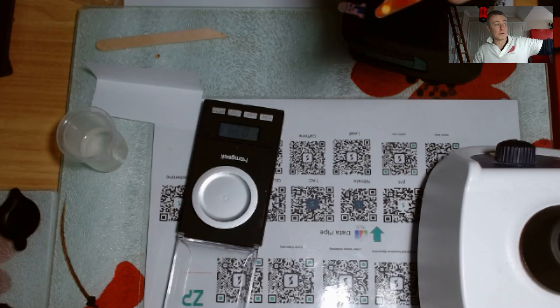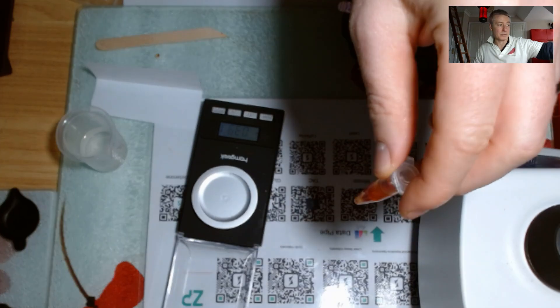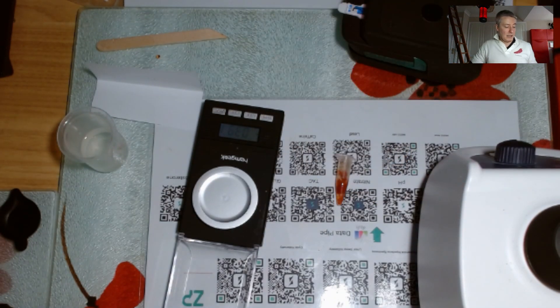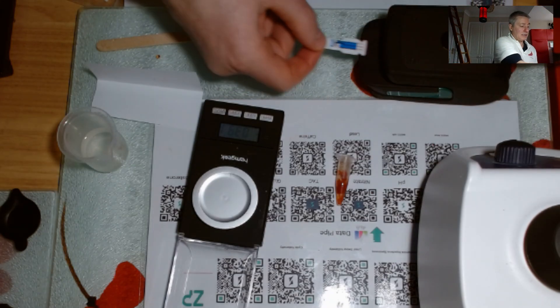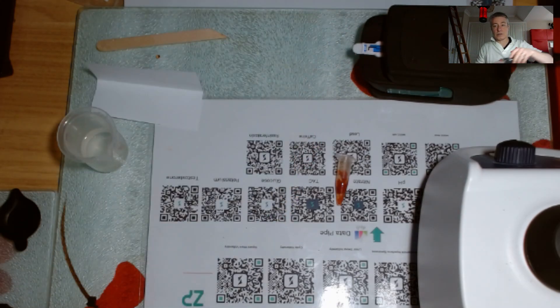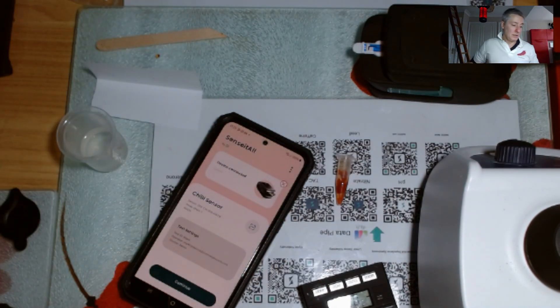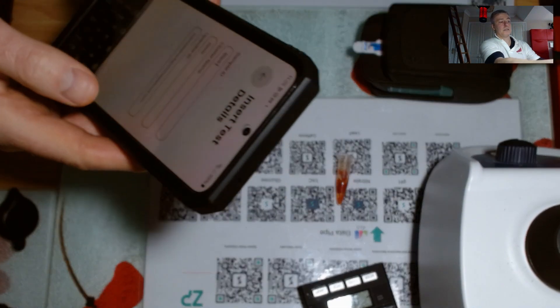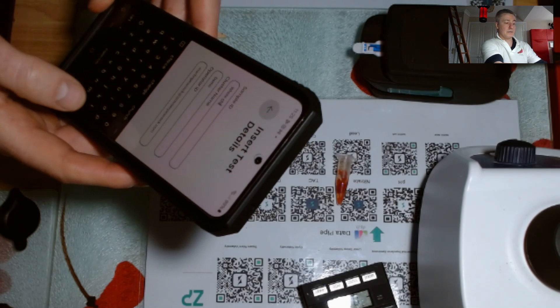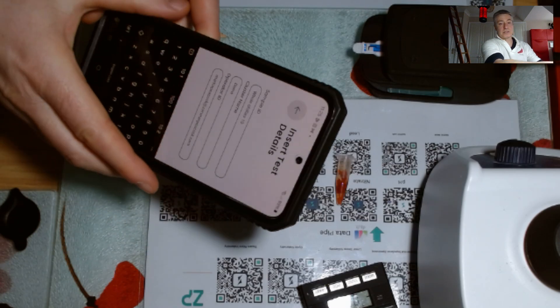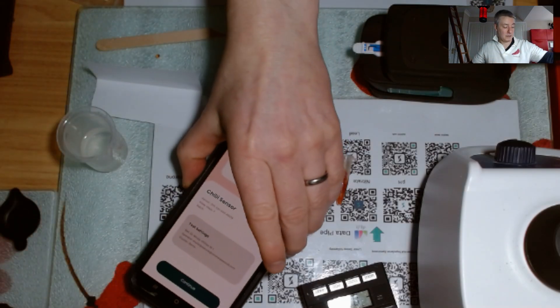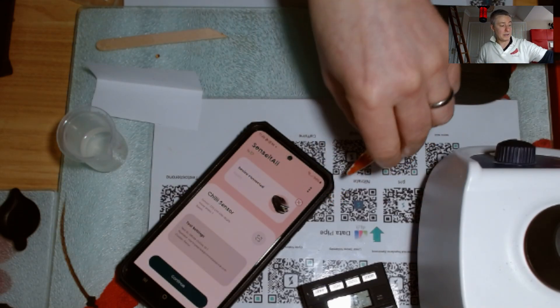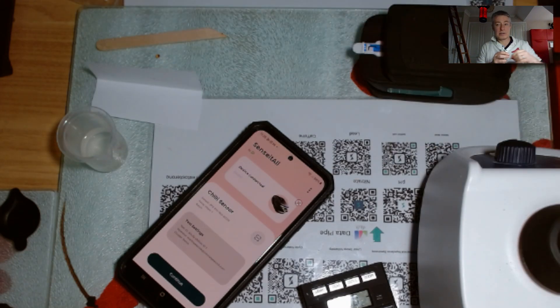Now I might really have wanted to do that for a bit longer, but I'm trying to make a watchable video and show you the principles here. So I've got my chilli in there, I've been vortexing it. What I'm going to do is I've got my chilli sensor, I'll put it onto my FoodSense Generation 4. I'm just going to get this balance out of the way so I've got a bit more space. I'll bring the app in here. I'm just going to make sure I name it in the app so I can find the data, so I'll just call this whole chilis.